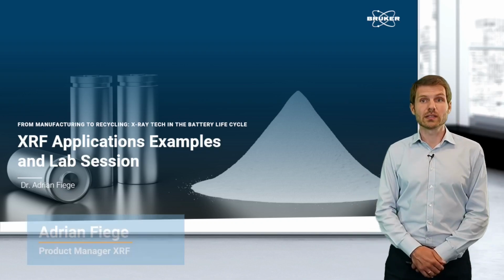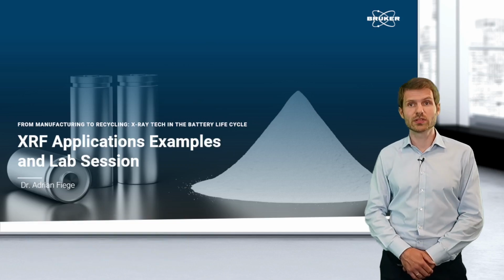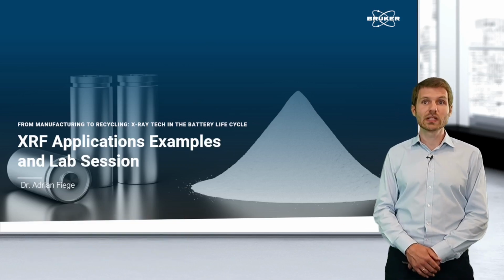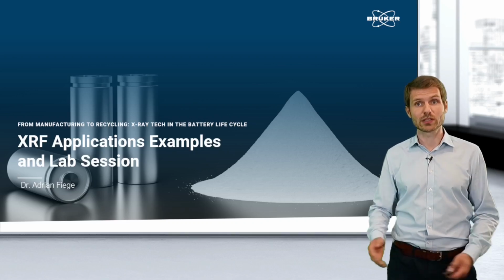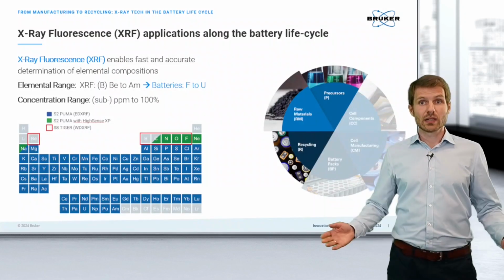Yeah, thank you, Michael. So my name is Adrian Fiege, and I will now take you through the second part of today's event, and this will be about elemental analysis with XRF in the battery life cycle, and we will close the session with a small lab session. So let's dive right in.